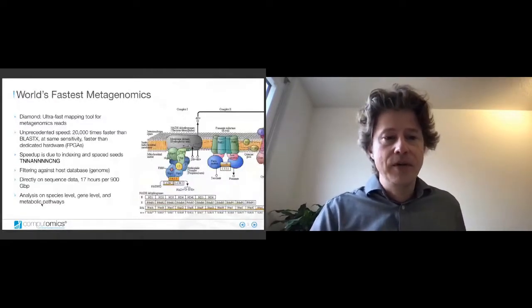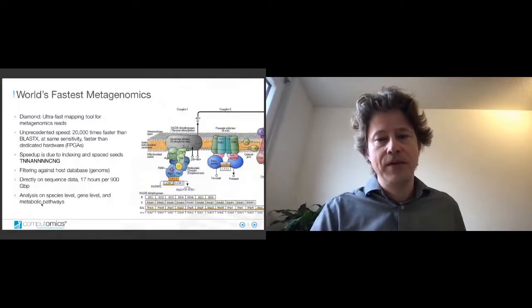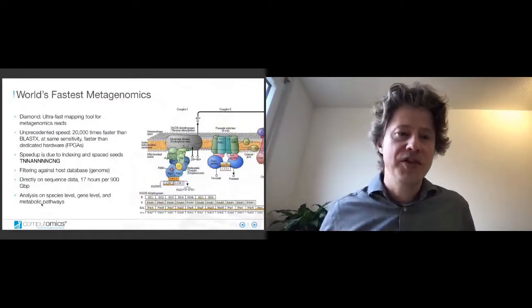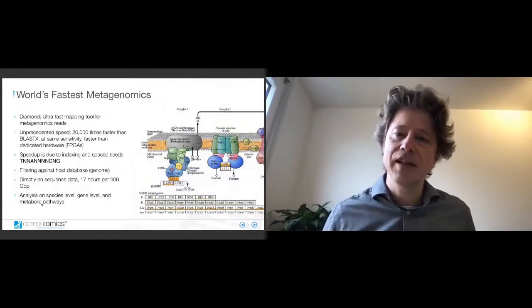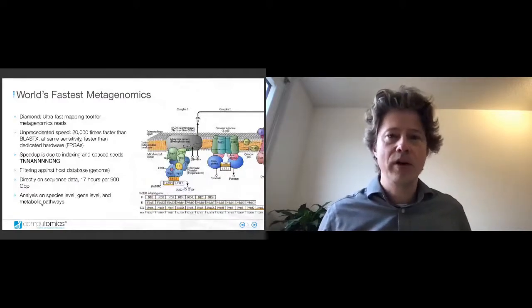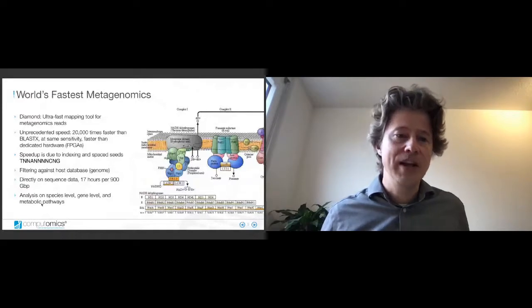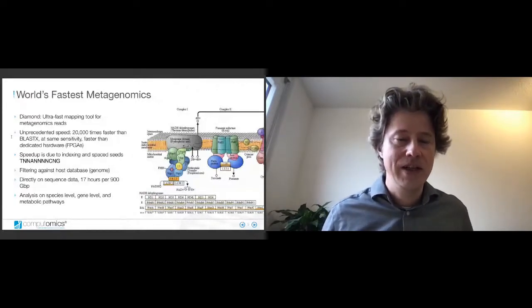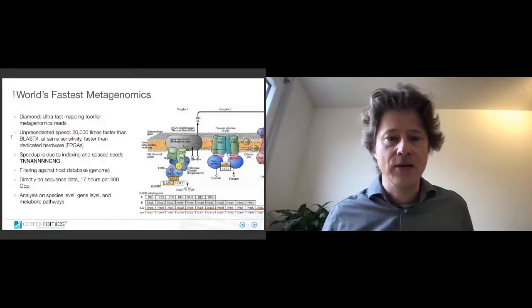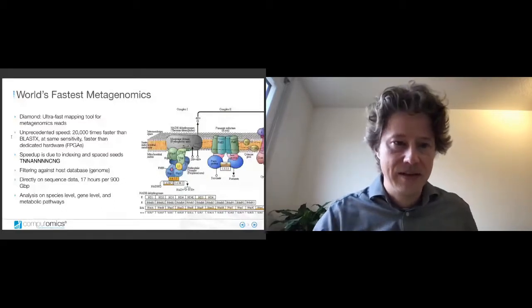I'm not going to go into detail about those technical features, but let me just say that MEGAN works really well with Diamond, which is a very fast protein alignment tool. So we have a very streamlined workflow, and it's really quick. You can get really quick turnaround times using Diamond integration, and you have very similar sensitivity compared to BLAST.